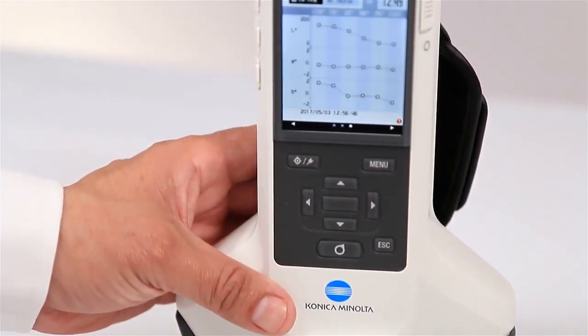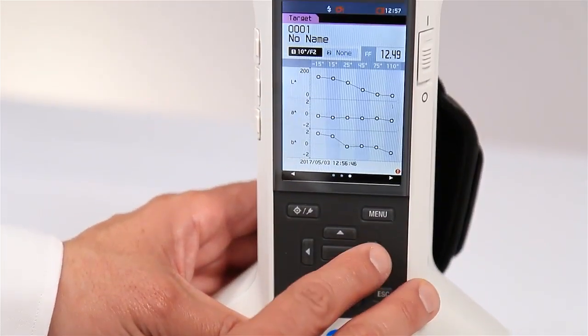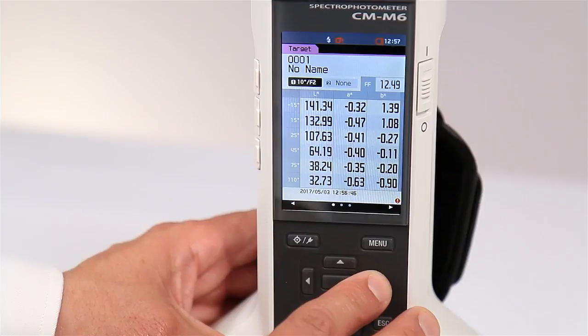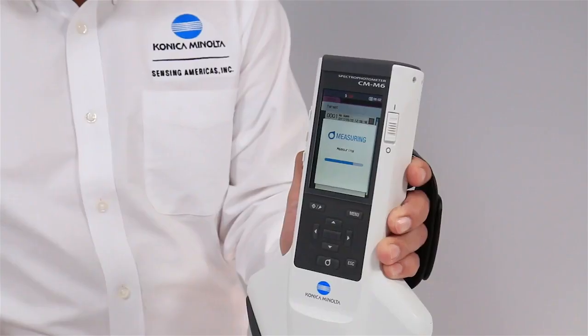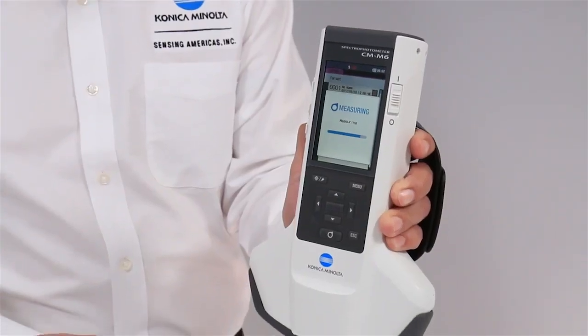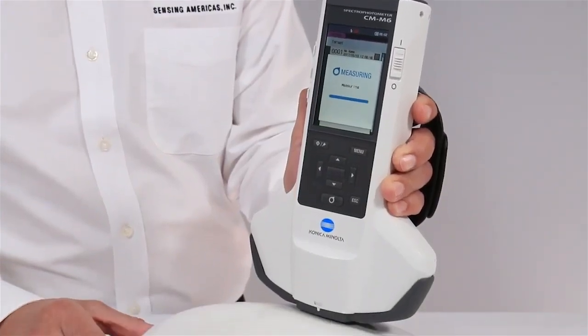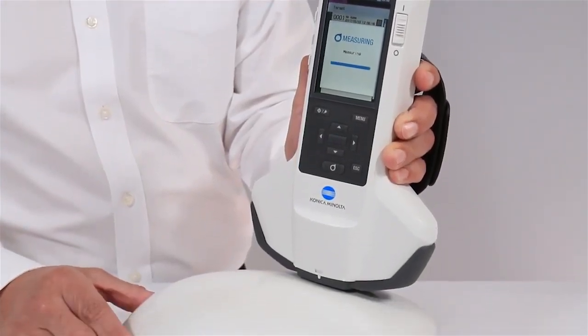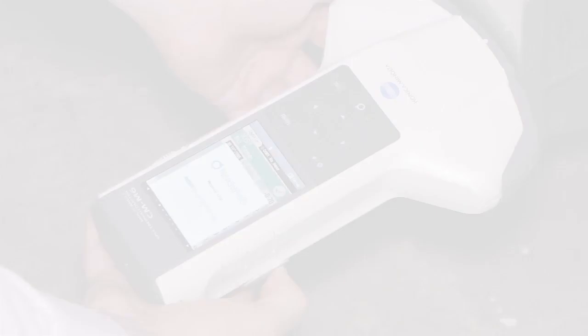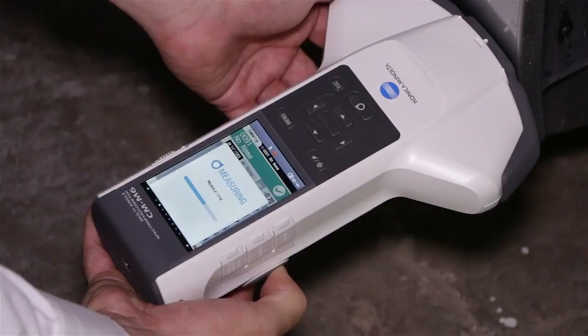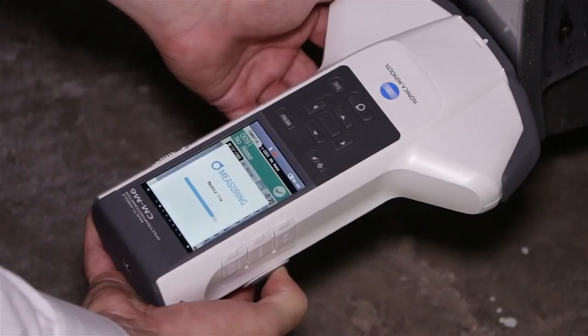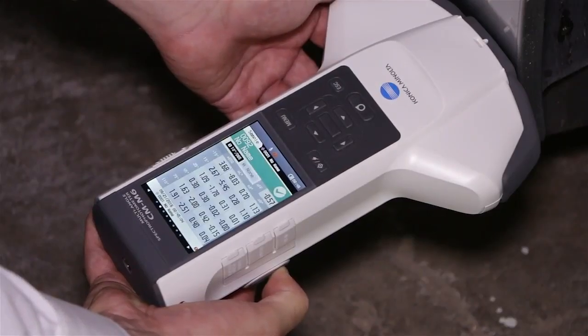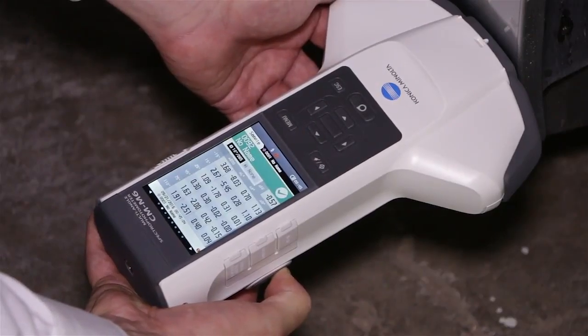Lightweight handling and a scratch prevention contact area provides comfortable and efficient operation. The CM-M6 stores 1,000 measurements and averages them automatically.